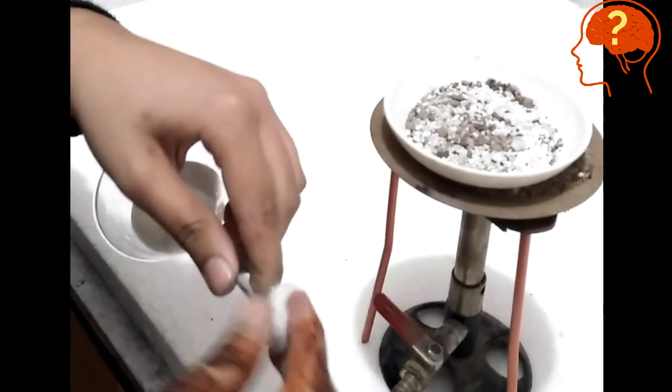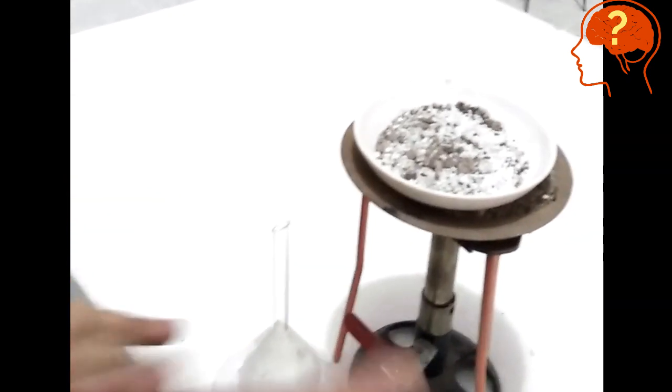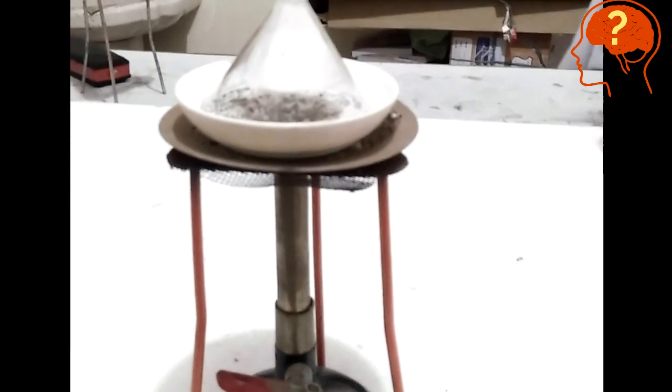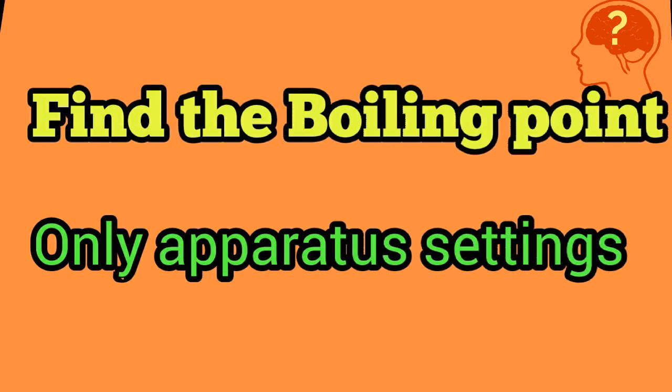Take the funnel and close its open end with the cotton. Place the inverted funnel on the top and place it in the apparatus for gentle heating for few minutes.